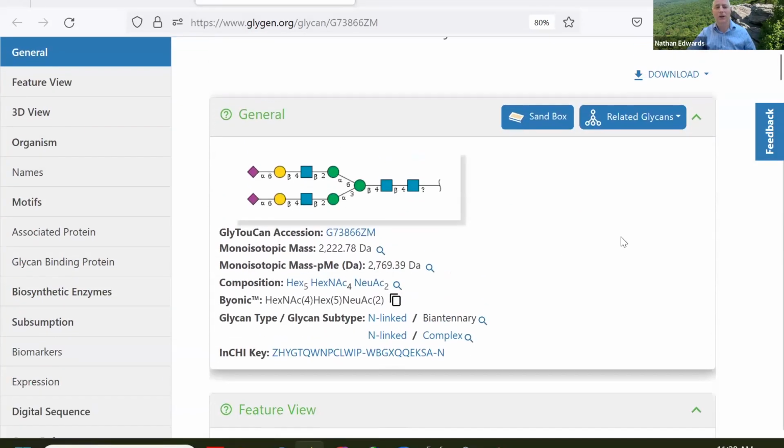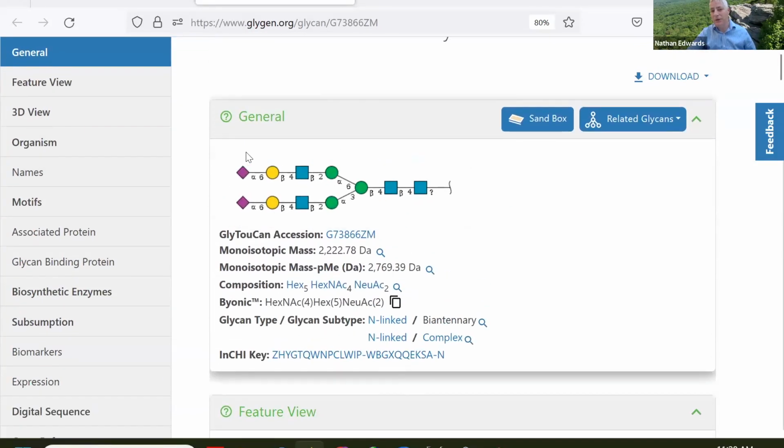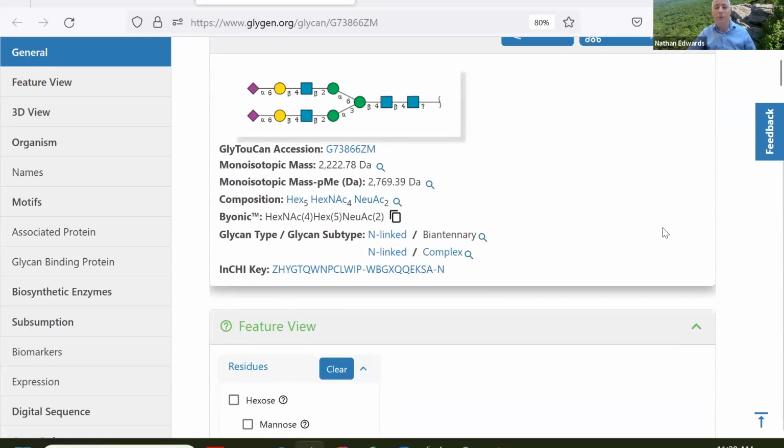Just some delay. So you can see that in this particular case, this is the alpha-6 linked sialic acids, the 2-arm over here, and without specifying the reducing end anomer. So this is not fully specified, but it is mostly specified.